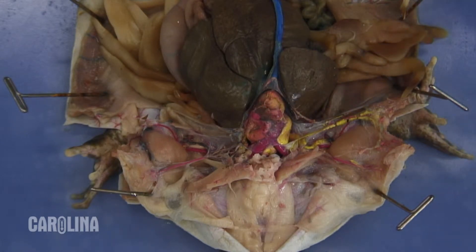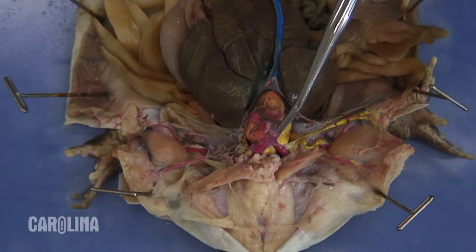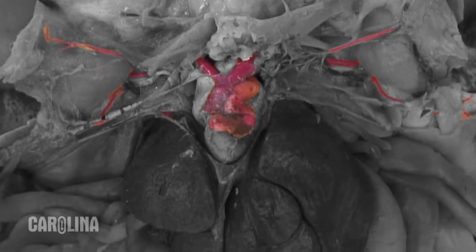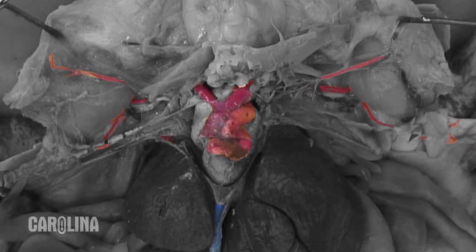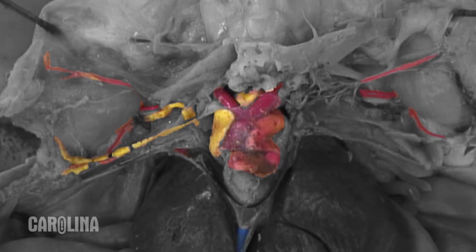Arteries are blood vessels that carry blood away from the heart, while veins carry blood toward the heart. A single injection has red latex in the arterial system. A double has the arterial system in red and a blue injection added to delineate the hepatic portal system — the veins of the digestive tract. And lastly, a triple has the arterial system in red, the hepatic veins in blue, as well as a third injection of yellow latex showing the systemic veins.